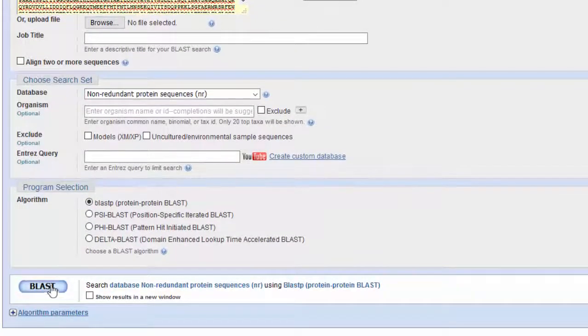So go ahead and run your blast. NR is fine. Swissprot would be fine as well, because this CDD is run whenever you click this blast button, and I'll show you where it is. We just didn't look at it yet. But they will be identical whether you use NR or Swissprot, so there's no point doing the 2 tabs and running it for the CDD part. That was for the blast part in general with the alignments. So I'm going to blast.